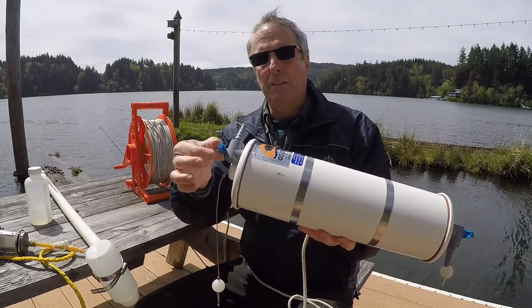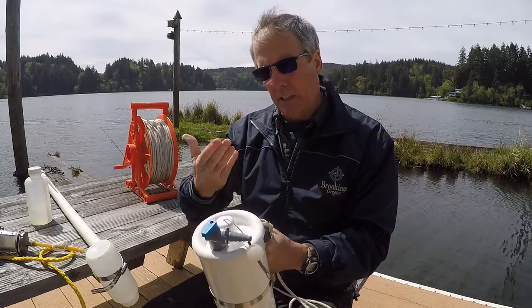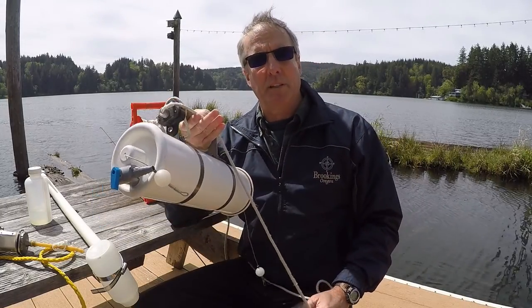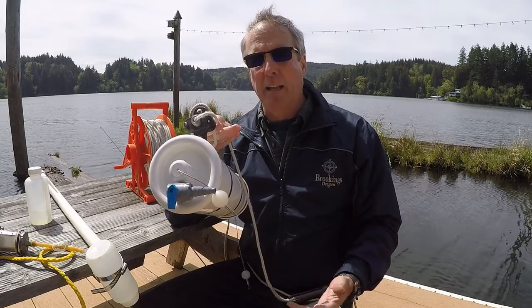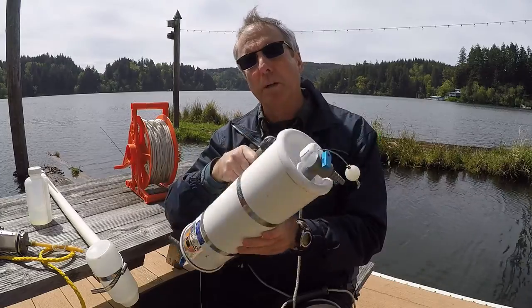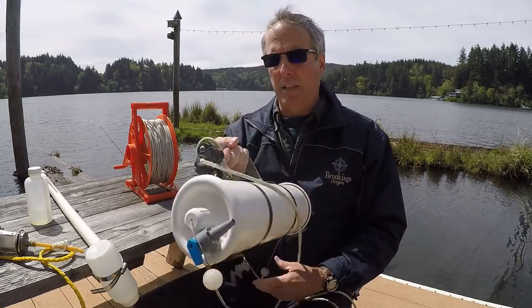So these are closed, and a lot of times you can do two things. You'll oftentimes want an actual water sample that you're going to send to a lab to analyze your nitrogen and phosphorus, because that's oftentimes what you're looking for when you're sending a Van Dorn bottle down in a lake. So that's where the stopcocks come in handy.